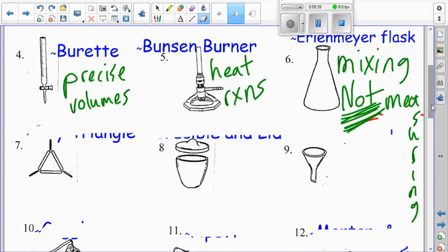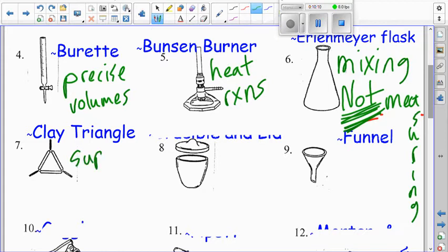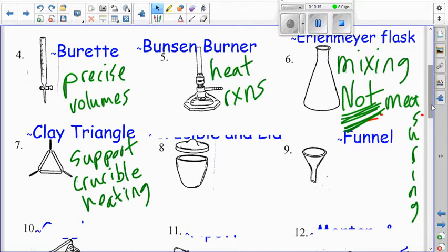Next one, clay triangle. What a creative name. Where is my clay triangle? It is in this drawer, my hardware drawer. Boom! This is a clay triangle. A clay triangle is often used with a crucible, which we'll talk more about here in a second. But you'll usually have a setup like this. Maybe you have a clay triangle set like that. You plop a little crucible right there. A clay triangle is used to support crucible heating, okay? So that's what a clay triangle is for.